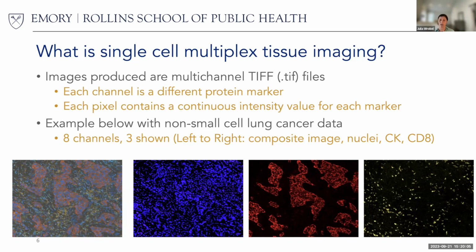But that brings up a point that's going to come up throughout the talk: there is a ton of bias in this data, and a lot of pre-processing that I think needs to be done and is underdeveloped in order to really trust the results you get at the final analysis step. But to your question, Miranda, yeah, please feel free to just interject whenever.